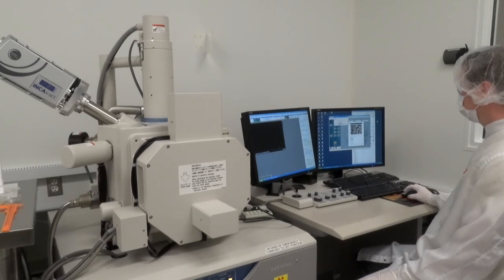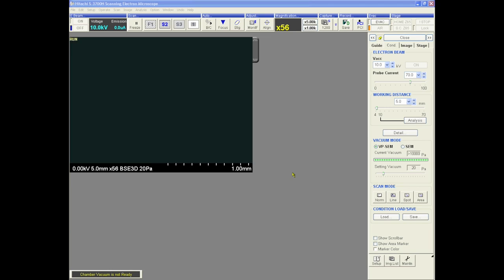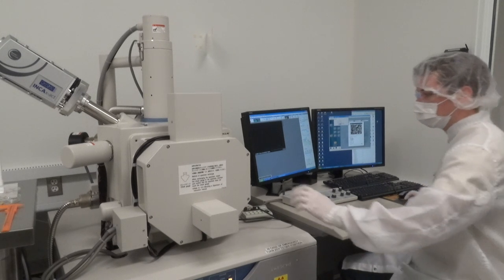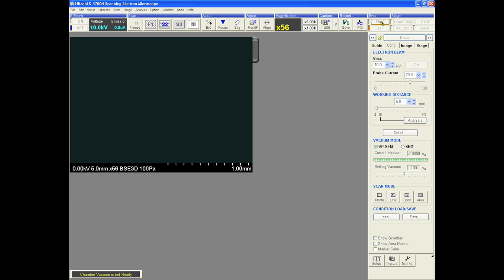First, set the vacuum mode to either SEM or VPSCM. For the purposes of this training video, we will be using VPSCM and set the VPSCM vacuum level. While holding the chamber door closed, press the evac button to begin pumping the chamber. The progress of pumping may be seen on the on-screen pressure gauge.